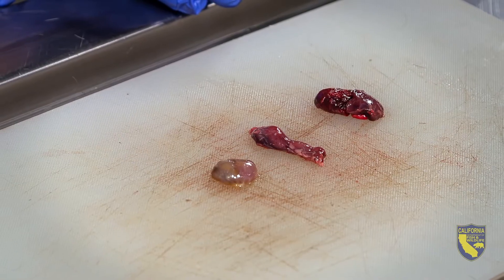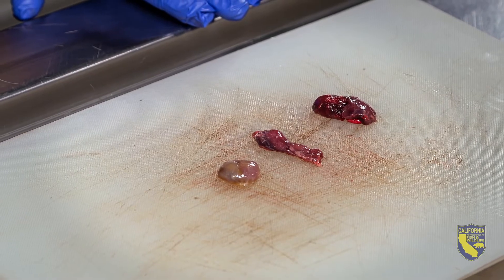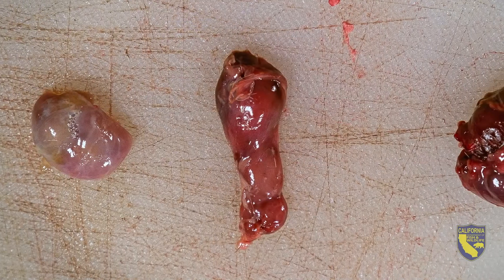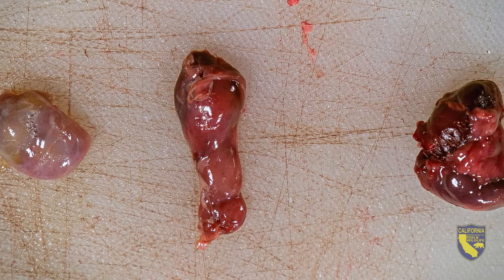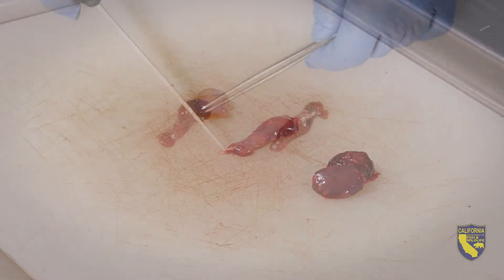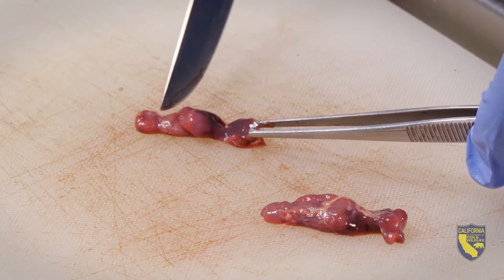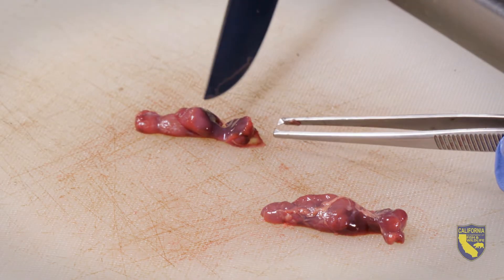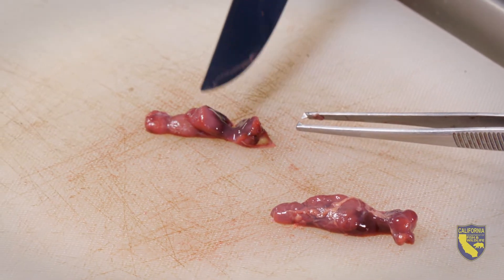Here we have retropharyngeal lymph nodes from three different deer. Lymph nodes can vary in size, shape, and color between animals. In general, they are semi-firm, kidney-shaped, approximately nickel to quarter-sized, and tanned to light red in color. To confirm you have a lymph node, bisect the sample along the short axis. You should be able to see some discrete, lighter-colored areas around the outside edge of the cut surface.